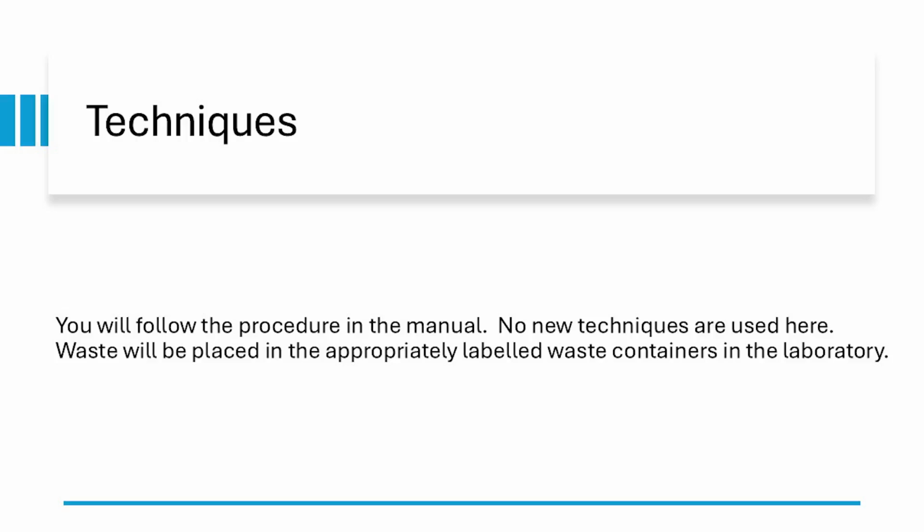So some techniques we're going to do is you're just going to follow that procedure right there in the lab manual. There's nothing new here. We're mixing things, we're seeing if a solid forms, and then we're writing out the equations. That's going to take you the longest time, writing out those equations in the laboratory.